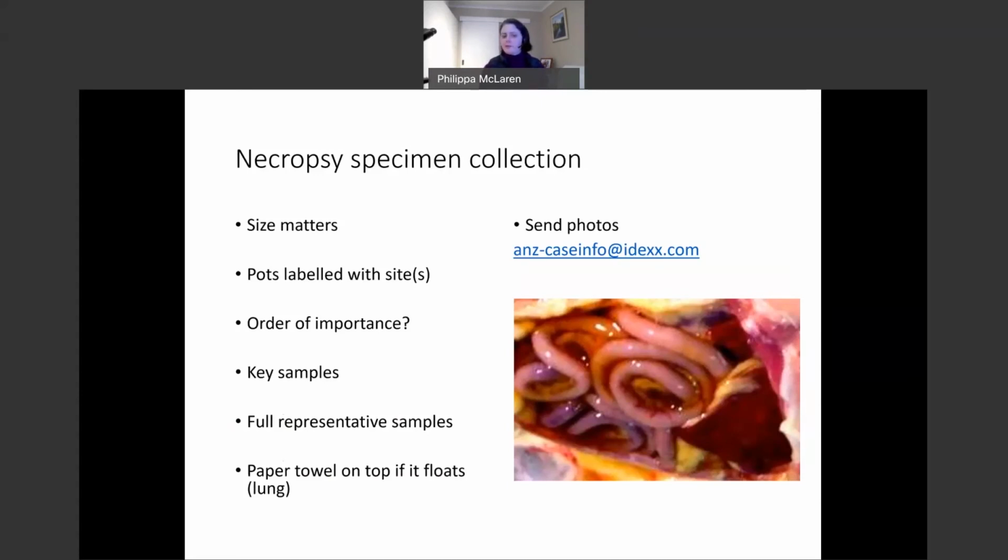Perhaps you might go so far as to take the brain out if you suspected neurological disease. Don't forget the spinal cord. And that might be into a 3rd pot because the brain is quite fragile. You might also be cost constrained. So you can submit pots and label them by order. And you can tell us, sample pot 1, hold the rest. And we'll happily hold them for months.